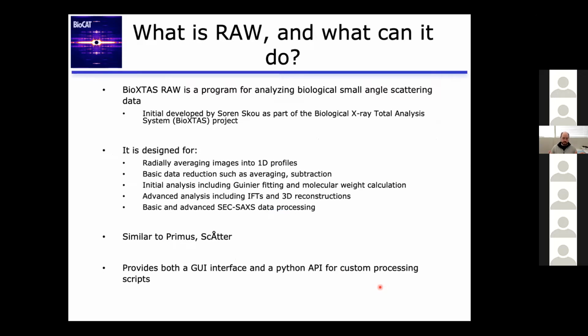Now what I'm going to do is spend some time talking about RAW and what it can do and how it can analyze SAXS data.